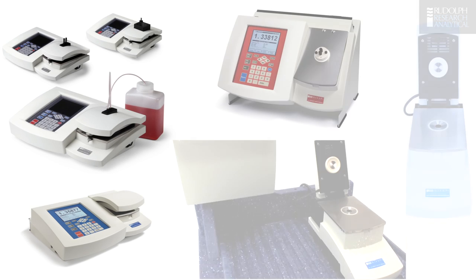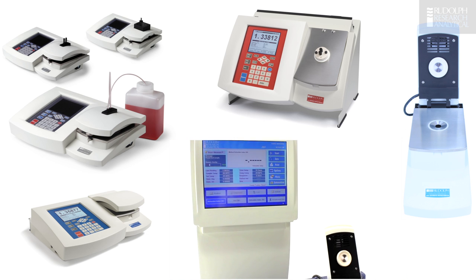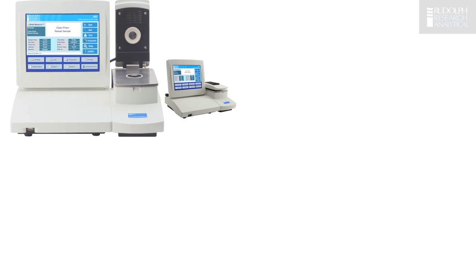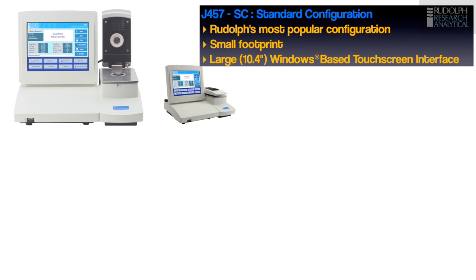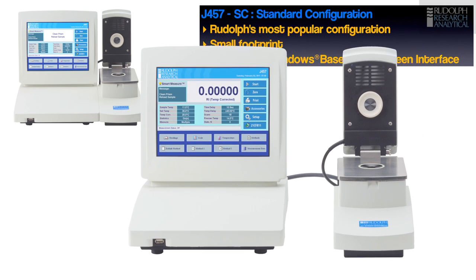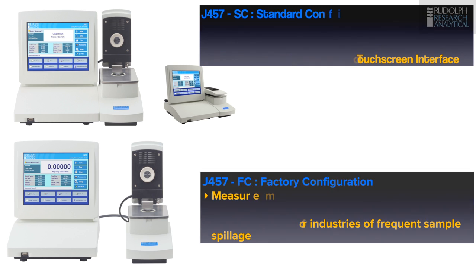With years of refractometer design and industry situations in mind, Rudolph has developed the J457 in various configurations. For the standard laboratory, the J457SC is a completely integrated unit that takes up just a small footprint on your lab bench top. For industry environments that can be harsh or where spills and splashes can be an issue, the display portion of the J457FC model can be located up to two meters or six feet away from the completely splash-proof measurement unit.